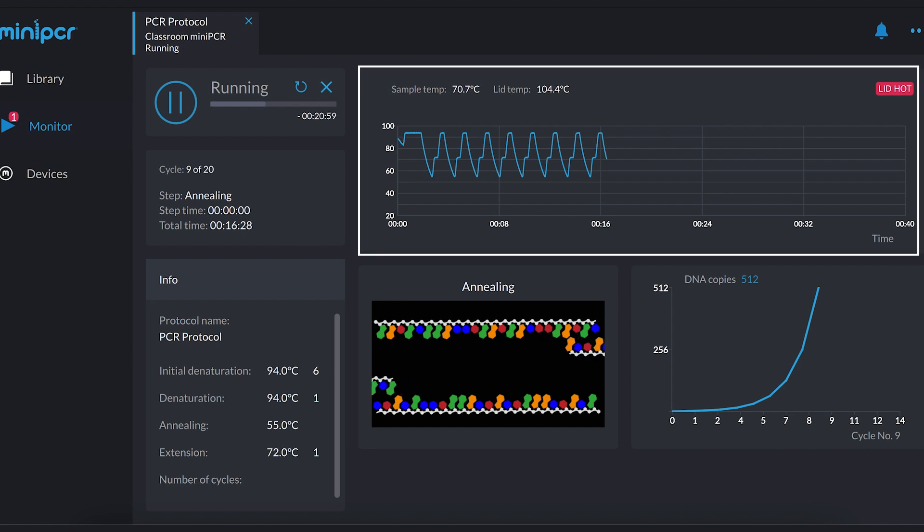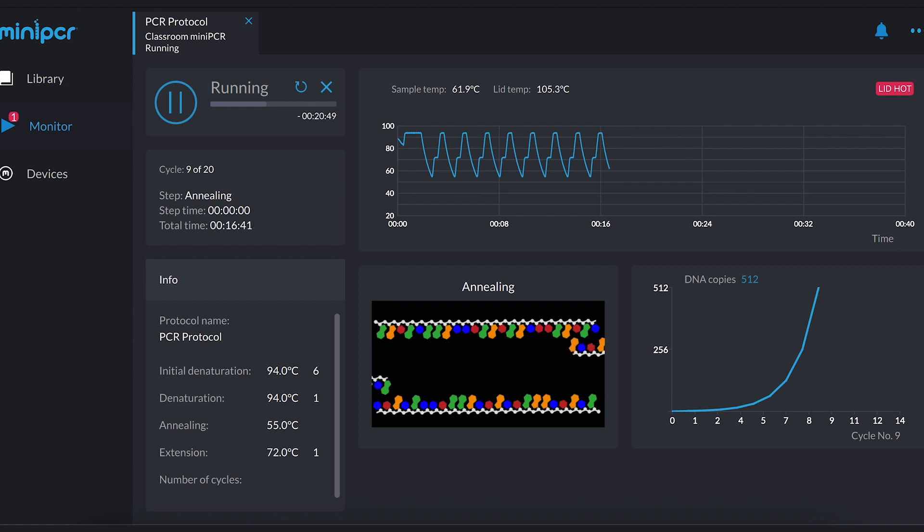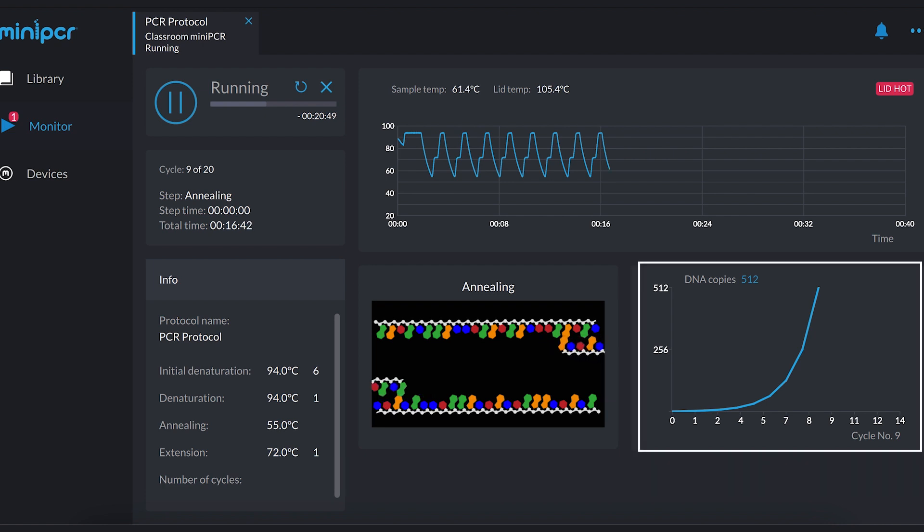For new users, temperature conditions in the tubes are graphed in real time, and an animated depiction of what is occurring at the molecular level allows students to visualize the reaction as it happens, reinforcing the fundamentals of PCR. Students can also see how the estimated number of DNA copies present in the tube changes over time.